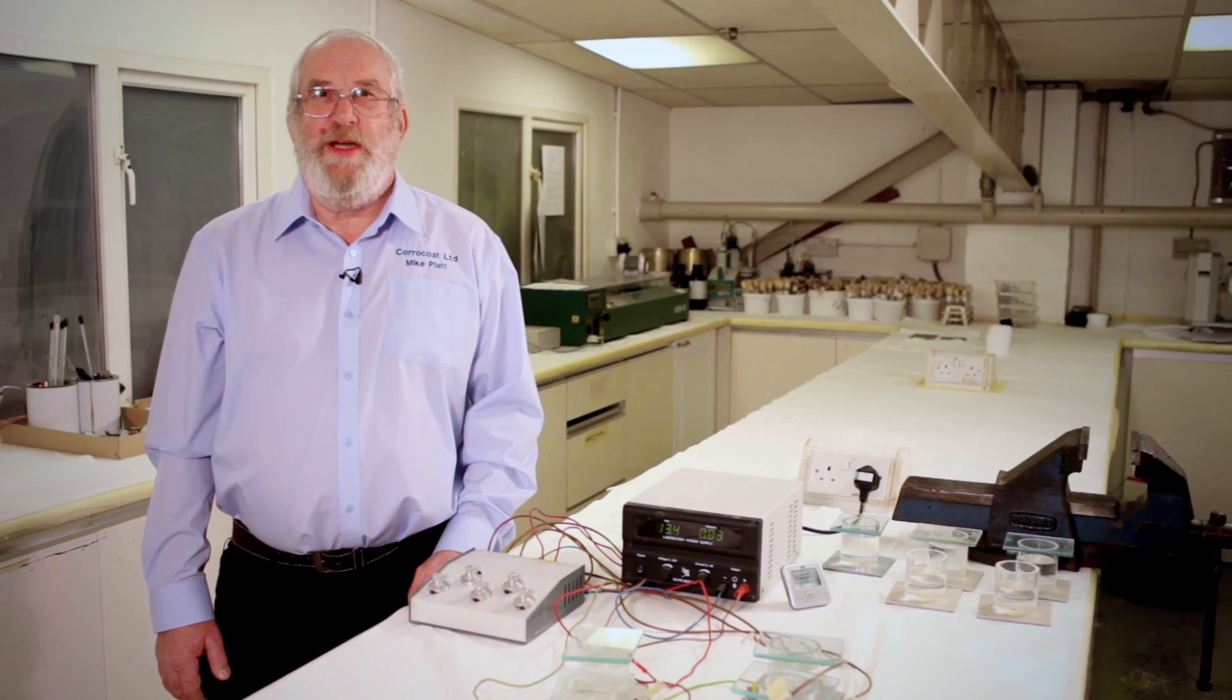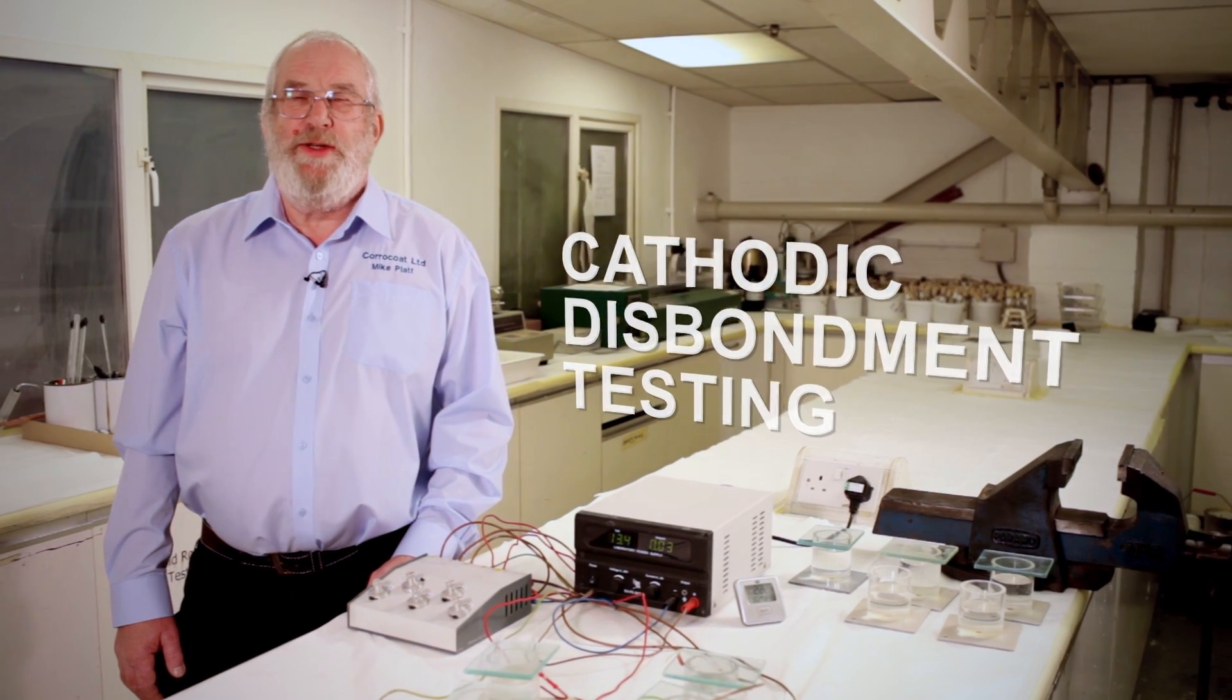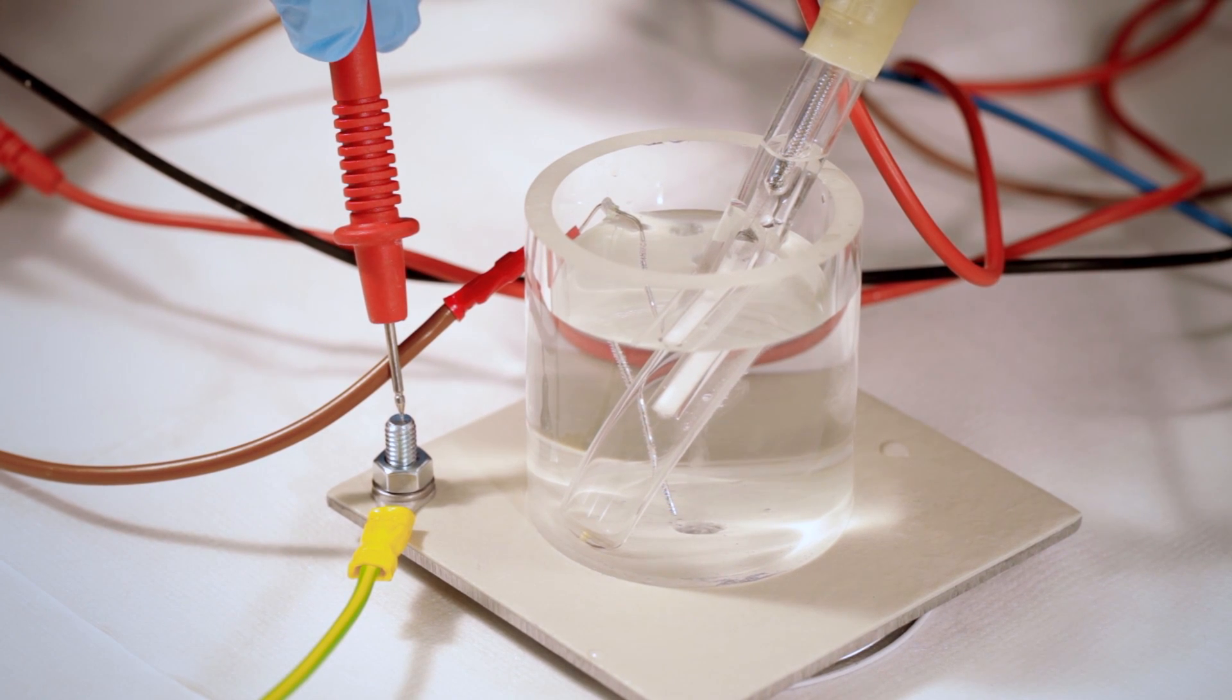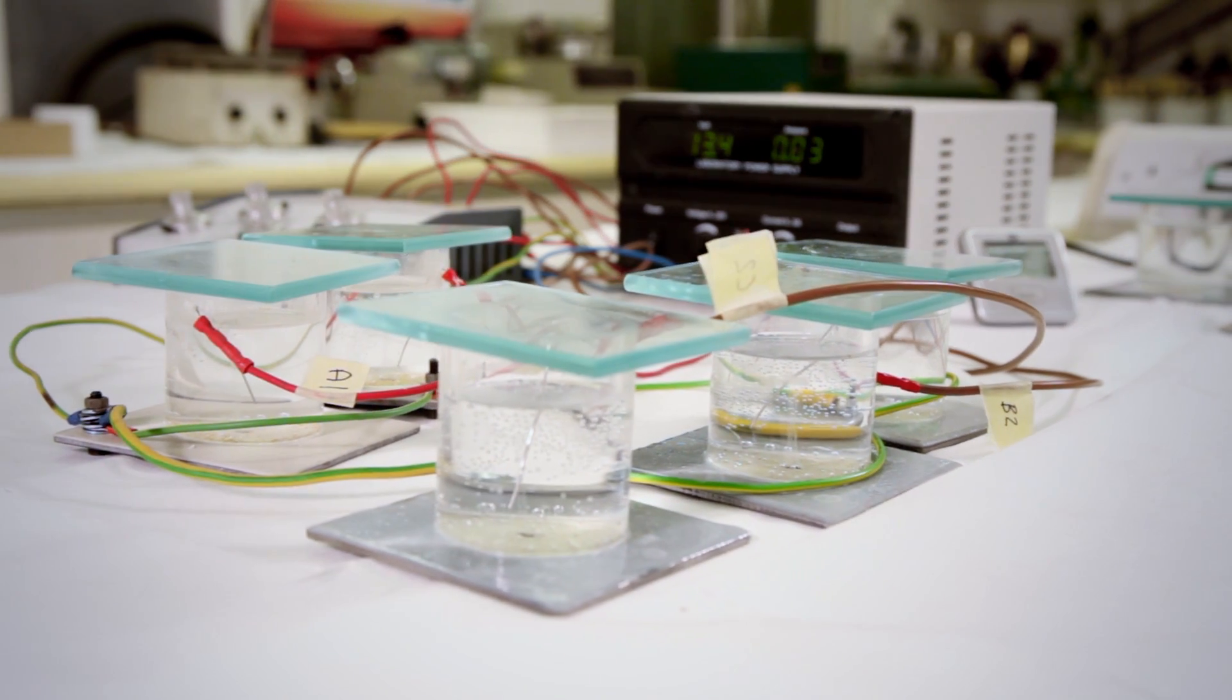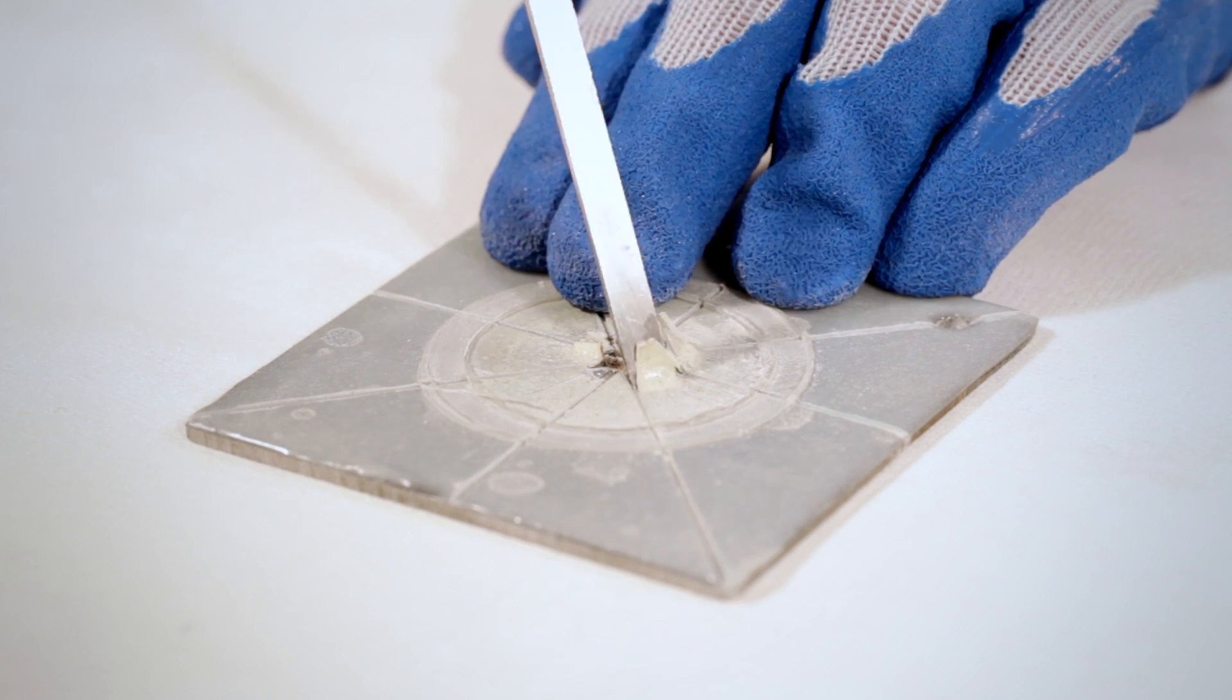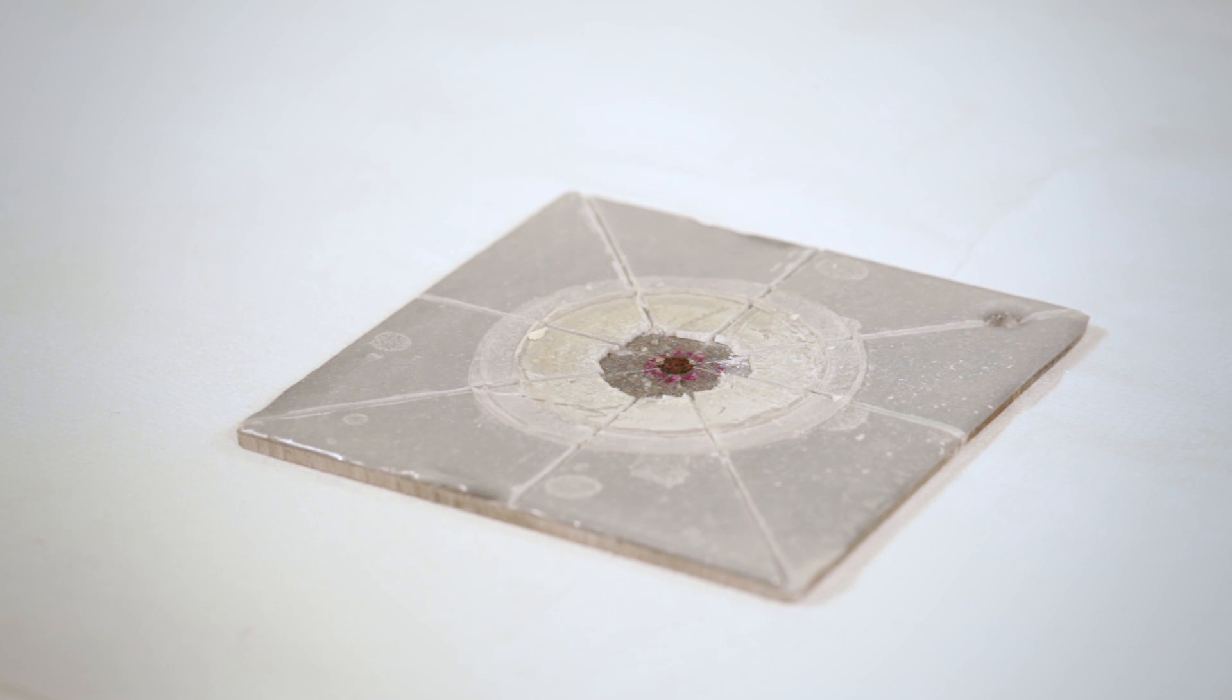This particular video is on the subject of cathodic disbondment testing. Cathodic disbondment testing is one of the tests used for assessing the performance of a protective coating. It's where a coating disbonds due to a cathode reaction at a damaged site through the coating to the substrate. This disbonding occurs by generation of hydroxyl ions which raises pH at the coating substrate interface and causes the coating to disbond.